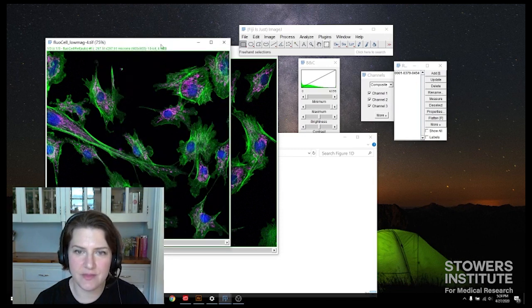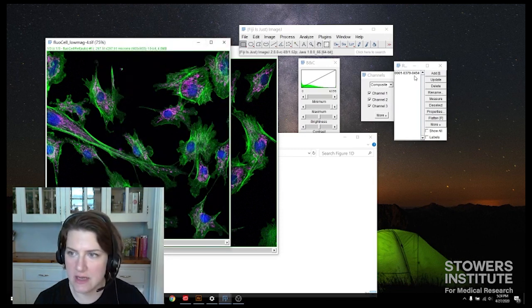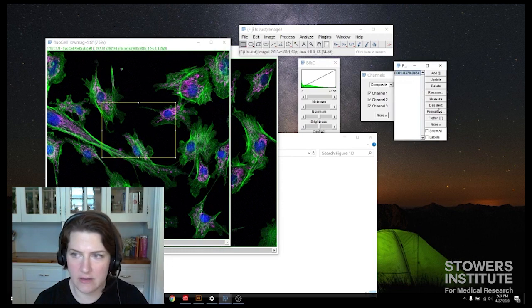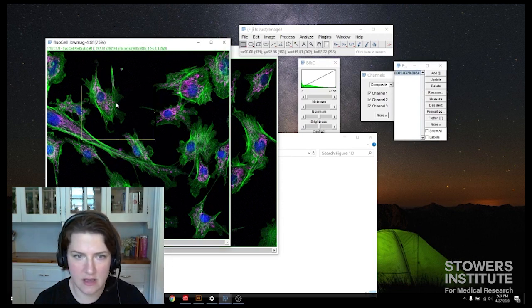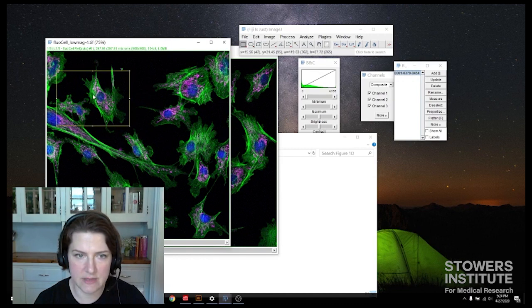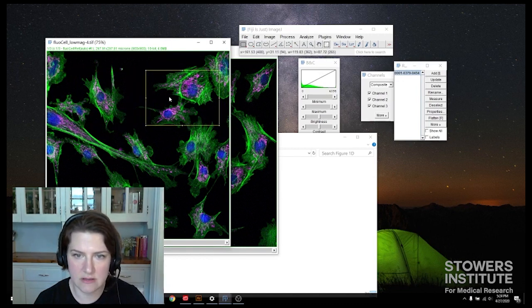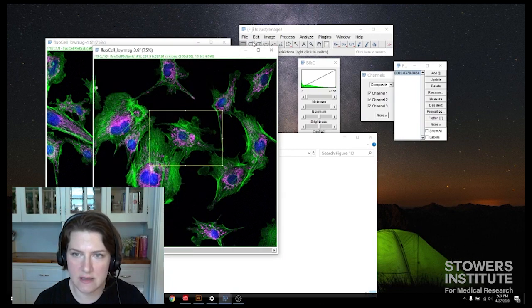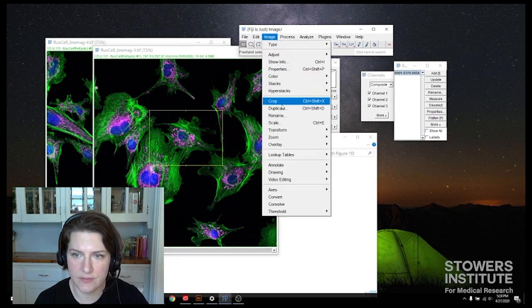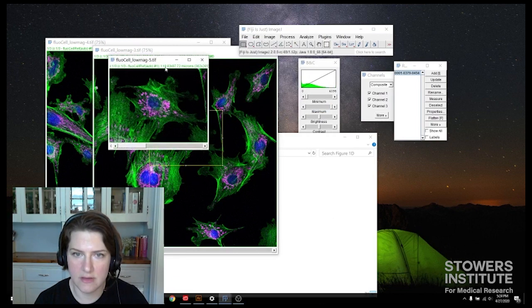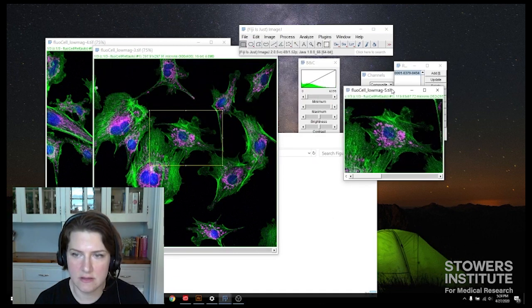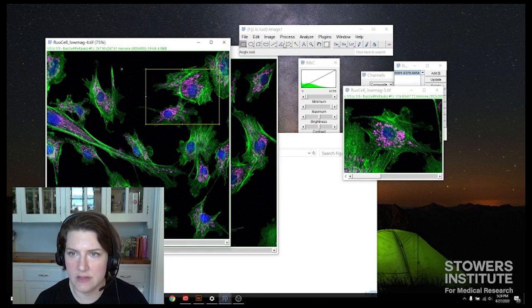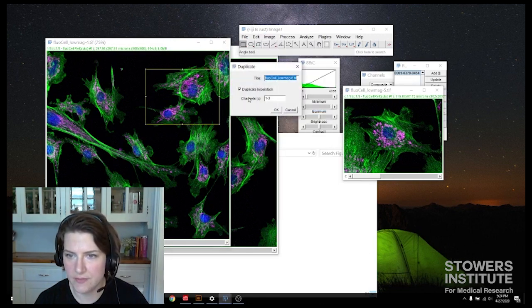I can either press T or I can go under edit selection add to manager and that puts it in the manager. Then I can go over to my next one and I can click on my selection here in the manager and I can choose my other cell that I'm interested in. So I want this region or this region. Okay. That looks good. So for both of these, I'm going to go ahead and duplicate those out. Great. Those are going to go in my figure later.